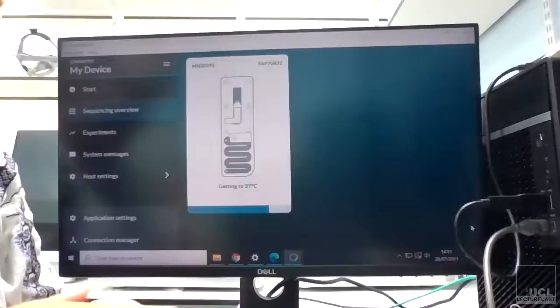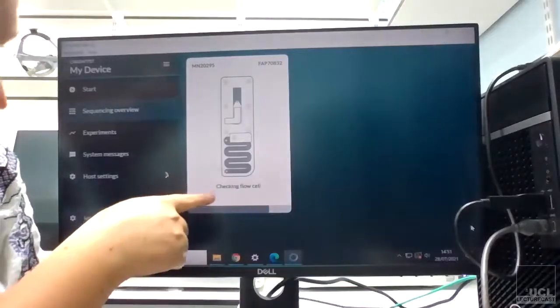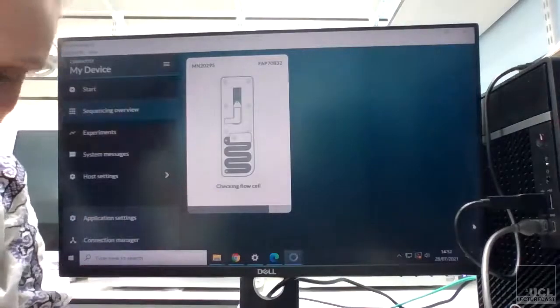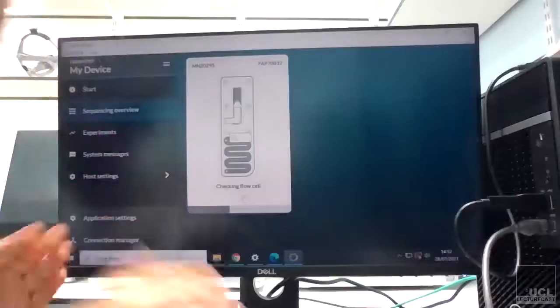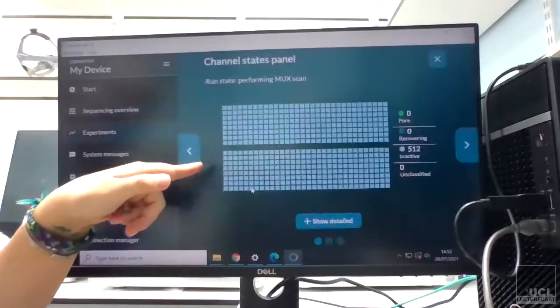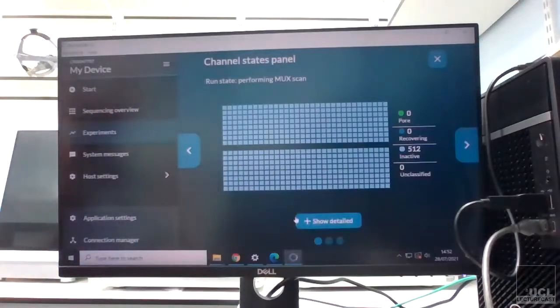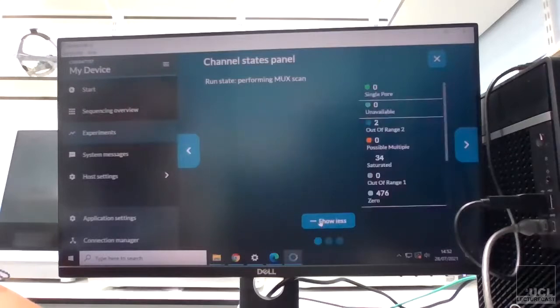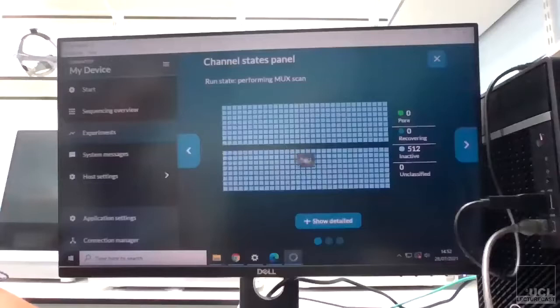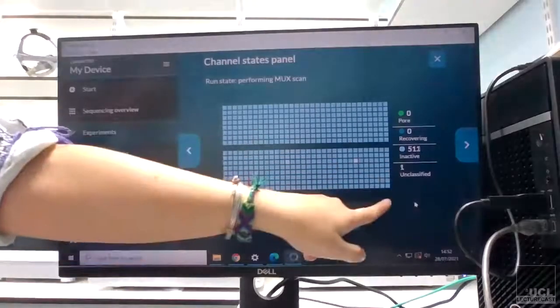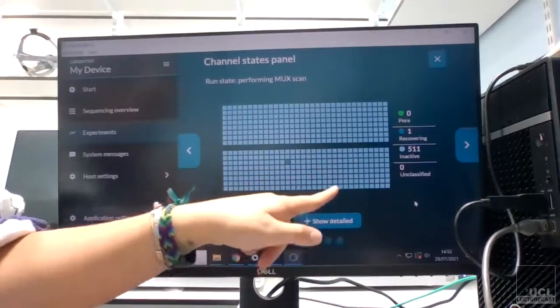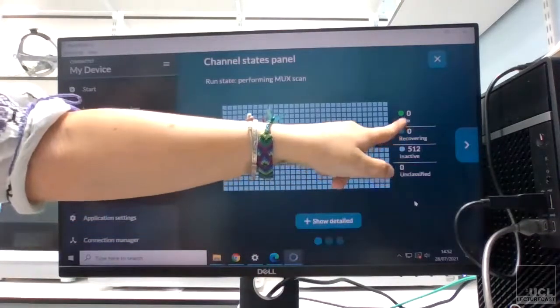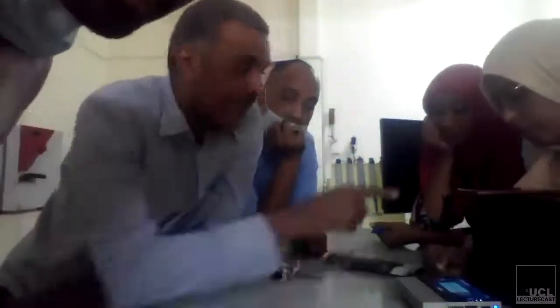Good, so mine now says checking flow cell. So you can click on here and that will bring up this channels panel. And so what it does—it should, once it's properly started, you'll see that it starts to check pores, and when it checks the pore and it's active, the pore will go green. There you go, like that.